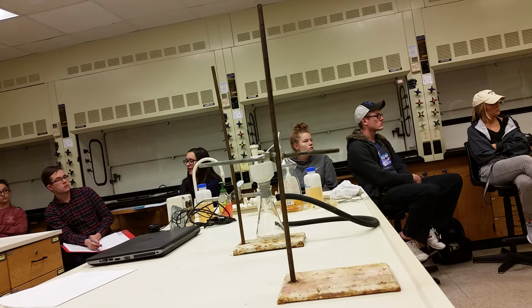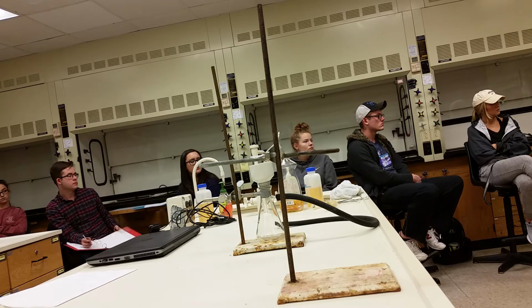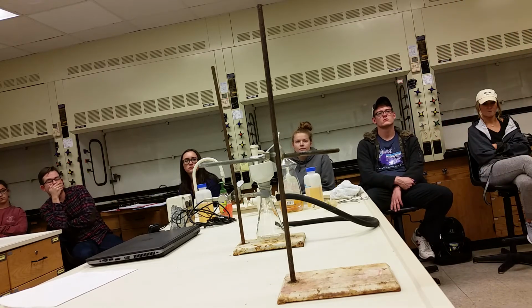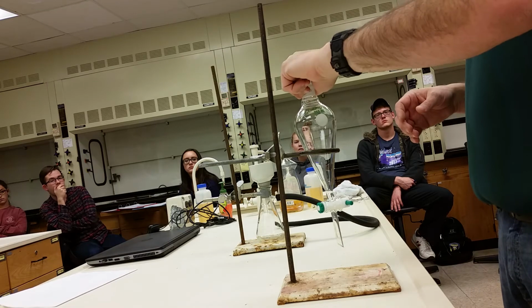Close, shake, open the vent. Close, shake, open the vent. Keep repeating that until you get no more gas buildup. Shake for a few minutes. As long as you've done that, you put it back into the ring stand.